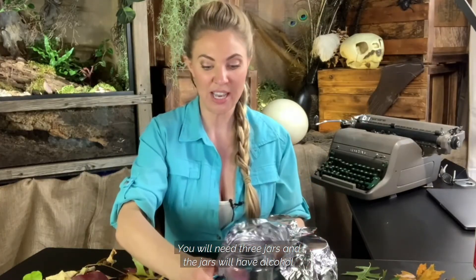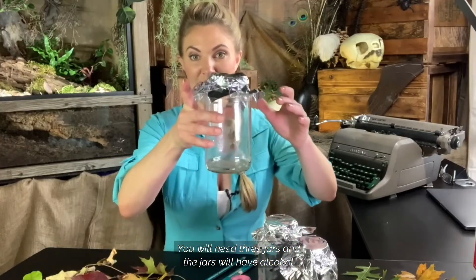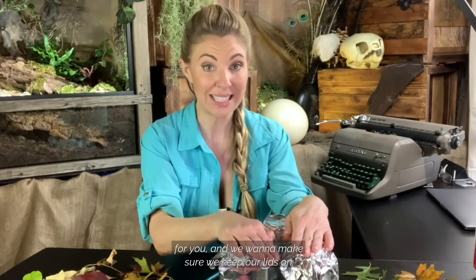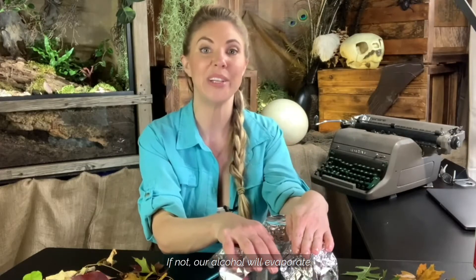You will need three jars and the jars will have alcohol. Your teacher should have put some rubbing alcohol in there for you, and we want to make sure we keep our lids on. If not, our alcohol will evaporate.